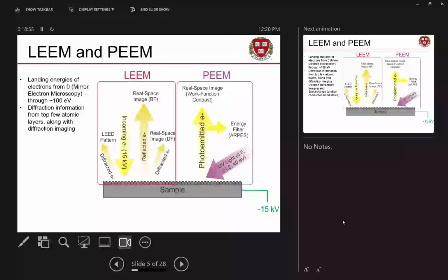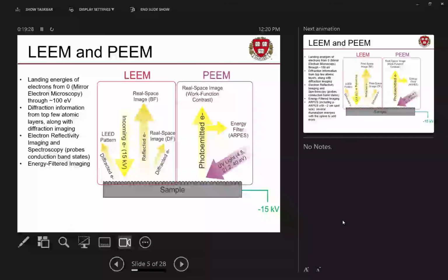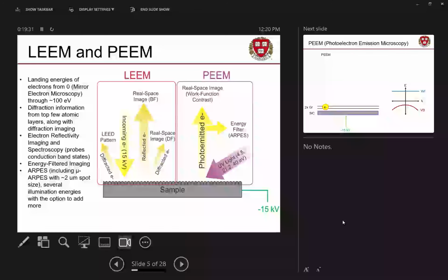All right. So we also get diffraction because the electrons are still waves. They're plane waves, in addition to being particles. They're coherent. And they are more or less all of the same wavelength because they're all the same energy-ish. And that means we get a diffraction pattern if your sample is a crystal, which is really useful because it means you can learn a lot about the crystal structure of your sample and do a bunch of really cool imaging techniques with acronyms. And then if we're using the PEEM gimmick where we shine light on it first, we get photo-emitted electrons. And we also can pull those off and do a gimmick called ARPES, which I will talk about. There's some spectroscopies you can do with this. There's energy filtering you can do. You can also put in apertures to do micro ARPES. If you know what ARPES is, this is that, but with very small spatial areas being probed.